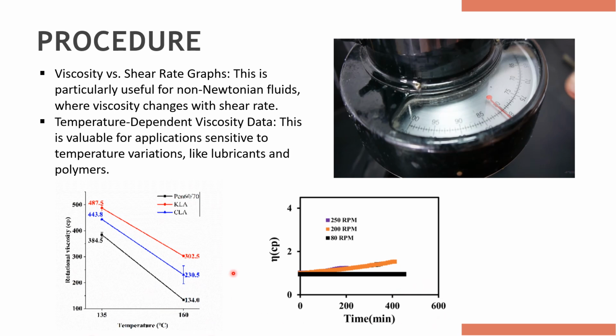Now here there is another graph where the viscosity is being measured with respect to time at different rotational speeds. So you can say that for 80 rpm the viscosity is constant with respect to time, like there is not much significant change, whereas for 200 rpm you can say that the viscosity keeps on increasing with time, and the same goes for 250 rpm also.